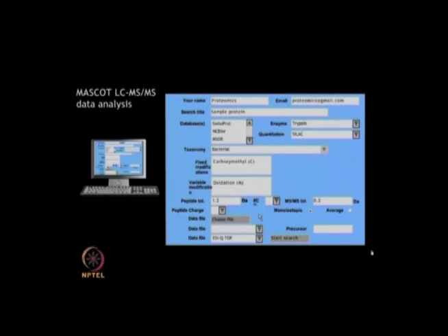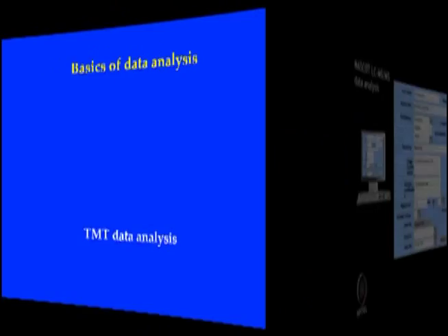The commonly used protein databases against which the MS information is processed to retrieve sequence data include NCBI, MSDB and SwissProt. The data file generated from MS is uploaded and the search is carried out.